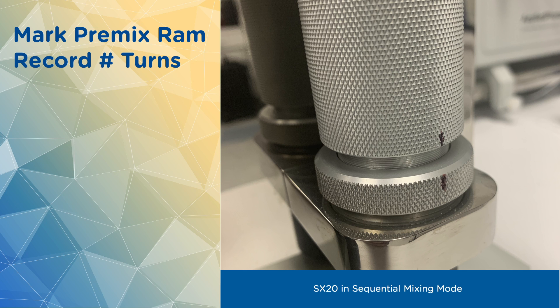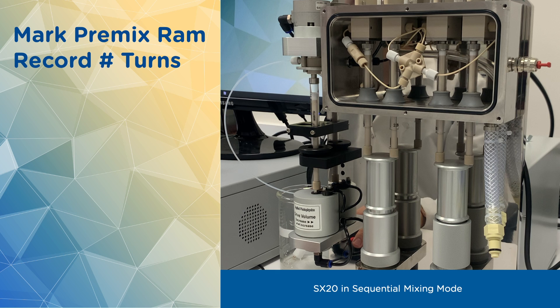Don't forget to mark premix RAM and record the number of turns to go from single to sequential mixing to easily switch between the two modes in the future. You can also leave the premix RAM on the instrument if you like.